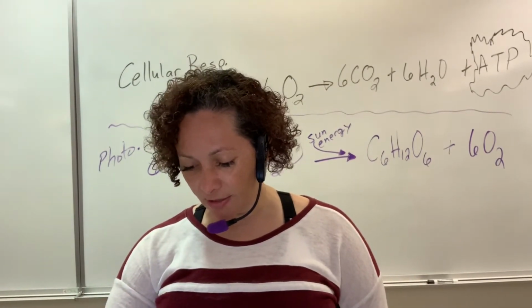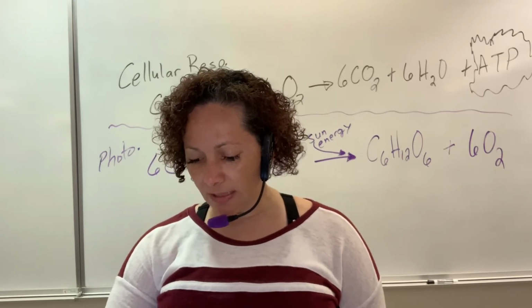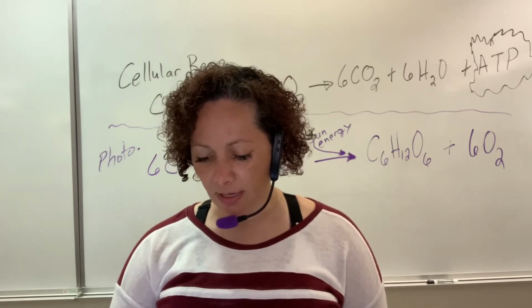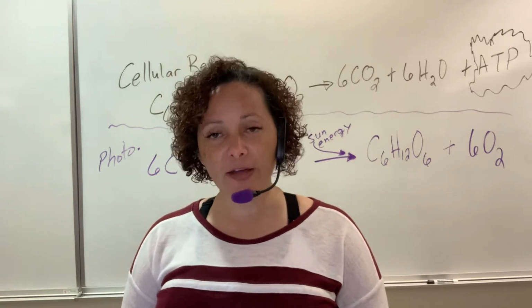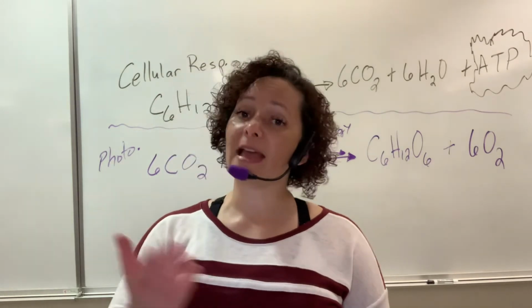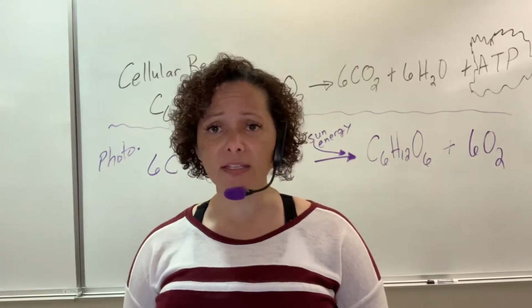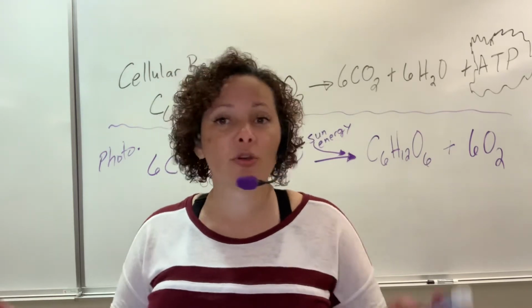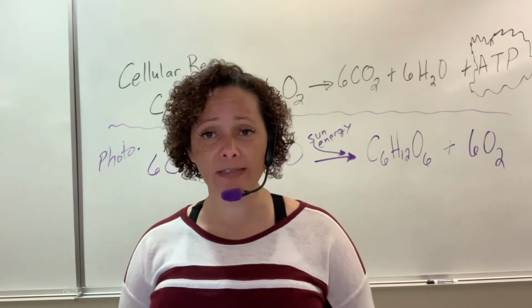Before you get started, I have gone through past figure 4. What we're going to be reading, just go ahead and pass your figure 4 in photosynthesis. It's before you state your hypothesis, okay? We are going to be trying to figure out the respiration rate of our organisms, okay? So we're going to do some animal organisms and some plant organisms. Like I told you, depending on the campus, depending on the availability, you don't know what they're going to be yet. So I've already given you a couple of the animal organism examples.